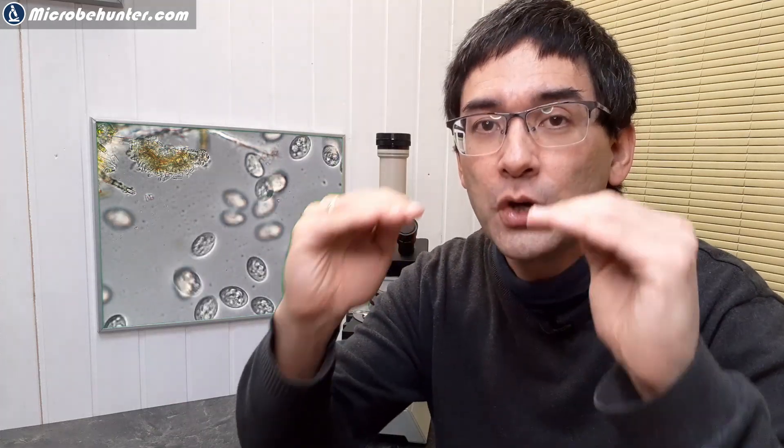Another advantage of taking pictures is that you can do so-called focus stacking. This means you can take pictures of different focus levels and then combine them using software into one overall image that is in focus all the way from top to bottom. This is not possible in video, at least not yet. So for static specimens, take a picture. It gives you more flexibility.